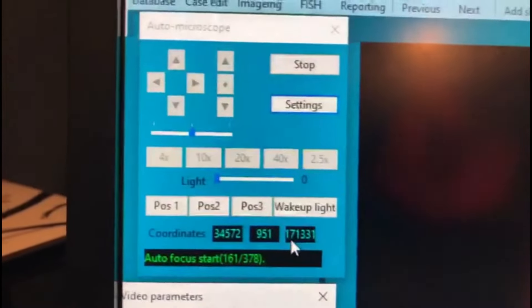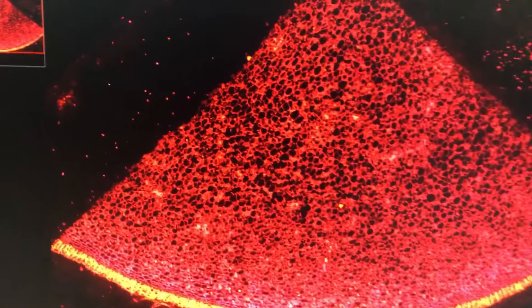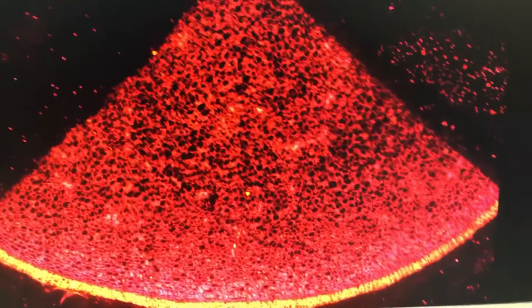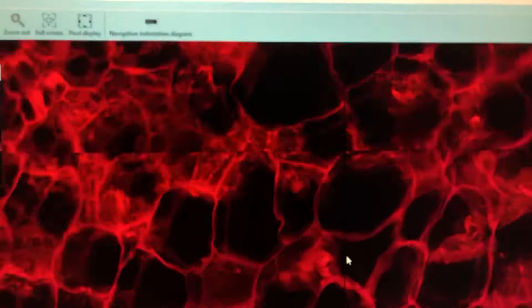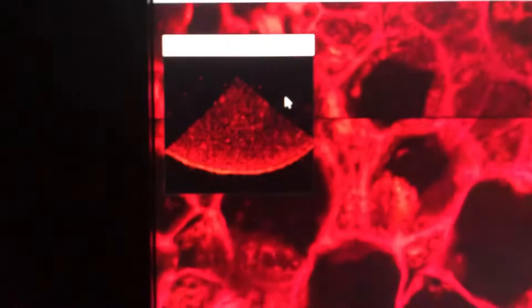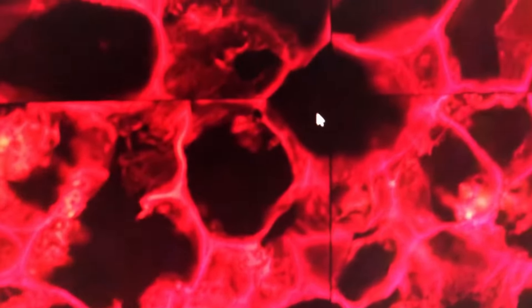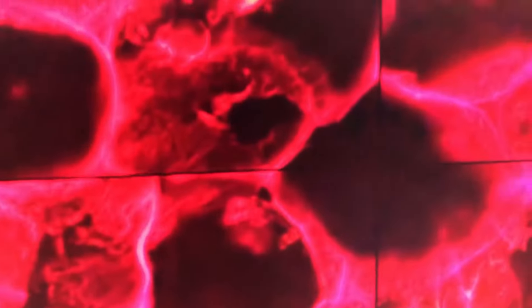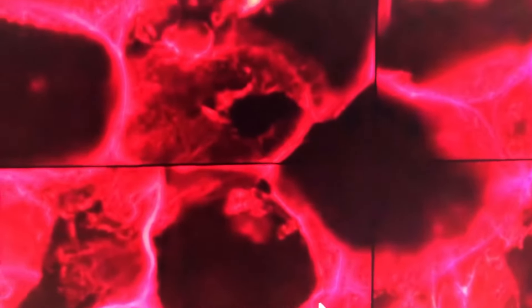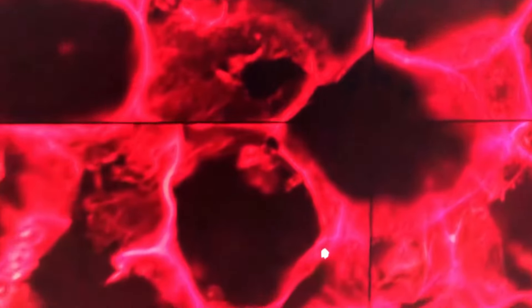Here we have the final result after scanning almost 400 images. All images are scanned and tiled together, and we can zoom in to look at different areas. The navigation bar shows which area we are looking at. The cross-lines here beautifully show how all four spots are overlapped together. Zooming out, we can also see areas that were a little bit saturated in bright regions compared to dim areas.